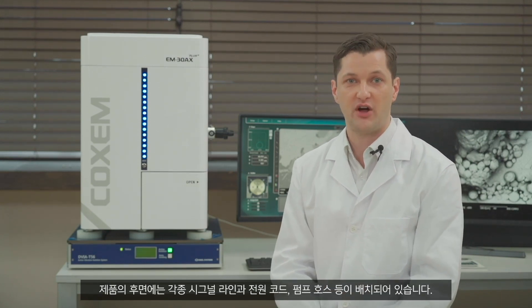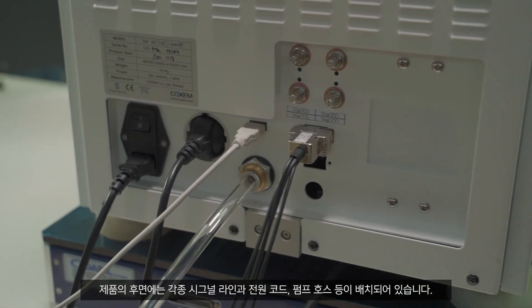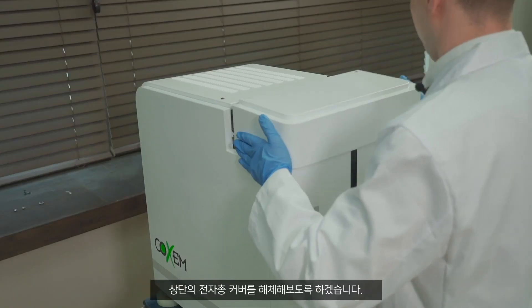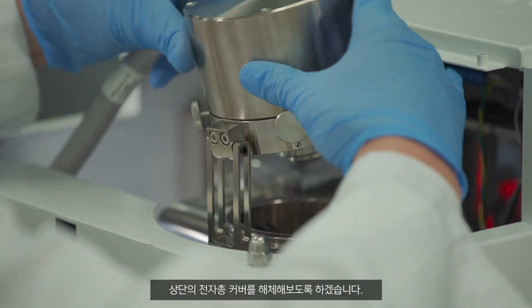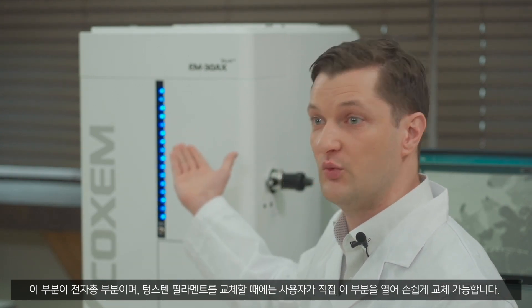On the back side of the product, there are various signal lines such as a power cord and pumping hose. Let's disassemble the cover of the electron gun at the top. This part is the electron gun, and an operator can easily replace the tungsten filament by opening this part when needed.